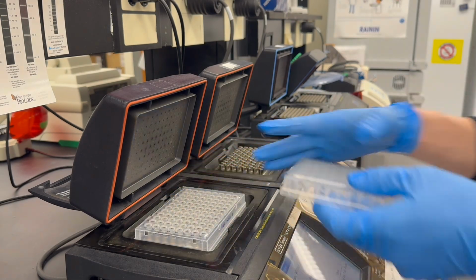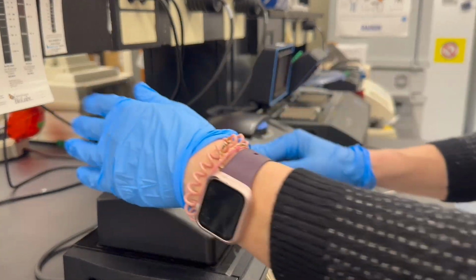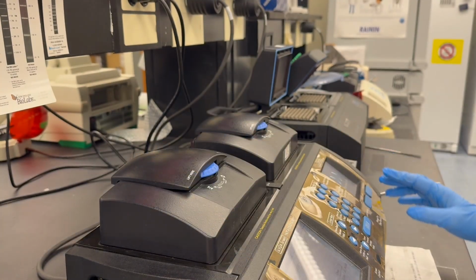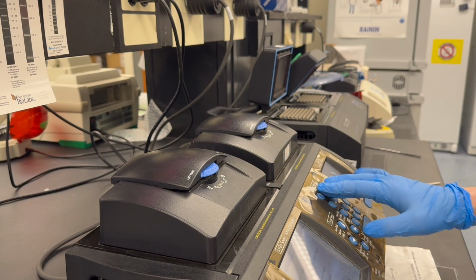We then run our duplicate PCRs in our main molecular lab, and these plates will never go back into our fecal DNA lab because the PCR will amplify the DNA to very high concentrations, and we don't want that to get back into our original samples.